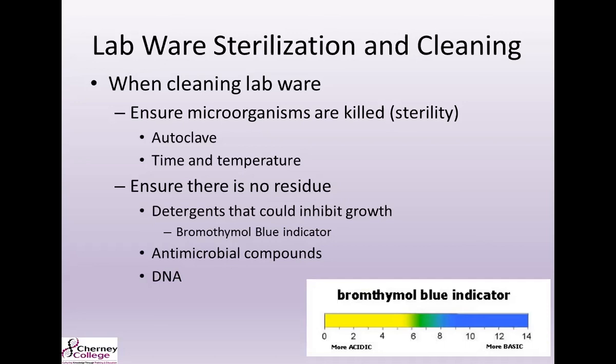As far as residue on your labware, you're going to want to make sure that there aren't any antimicrobial compounds, no detergents that could inhibit growth. And you're also going to want to make sure that you use glass labware whenever possible. I know there are some plastic options, but DNA can adhere to plastic, especially over time with use where you've got scratches. It's just not easy to keep clean.